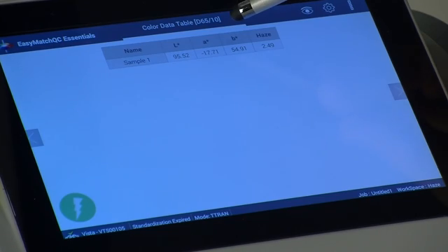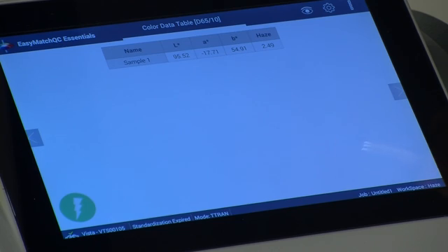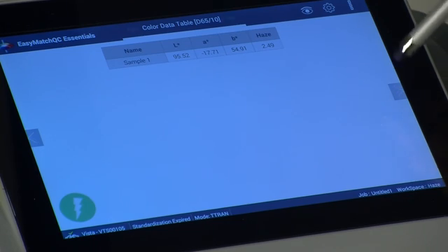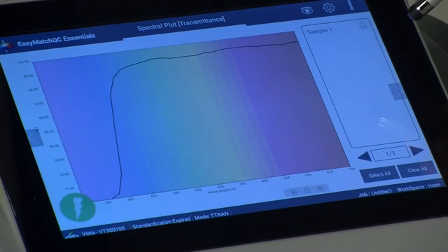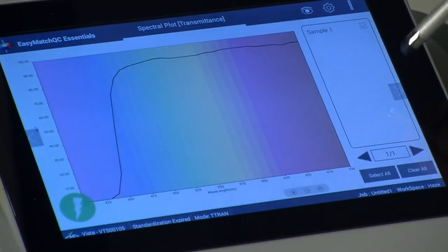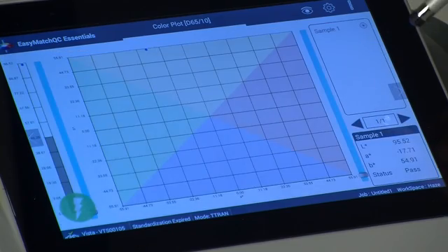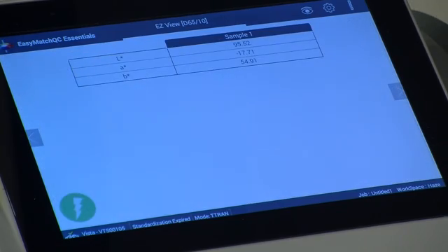Your color measurement data will be displayed on the screen. Additional views are also available, such as spectral data table, spectral plot, trend plot, color plot, and easy view.